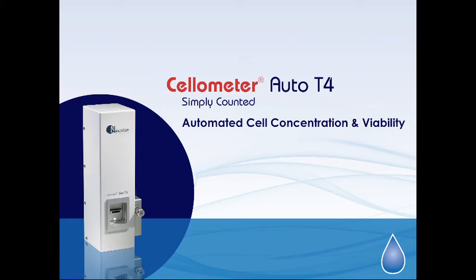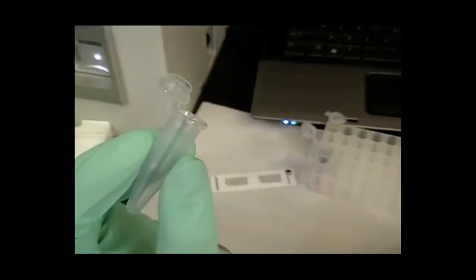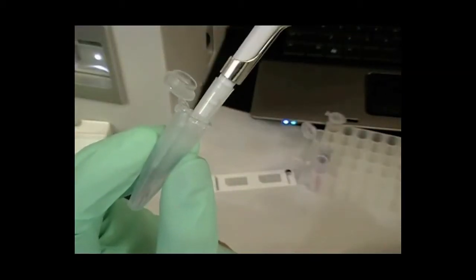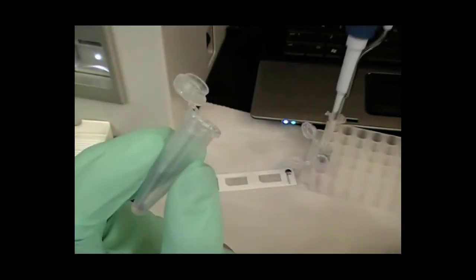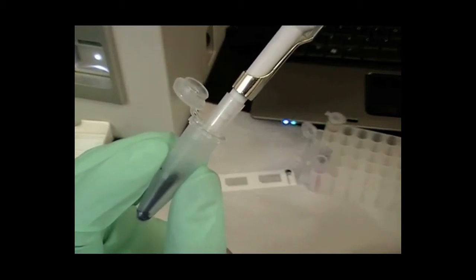The Cellometer Auto T4 offers automated cell concentration and viability analysis of cell lines and cultured primary cells. For concentration and viability analysis, cells are incubated with TriPan Blue staining solution.